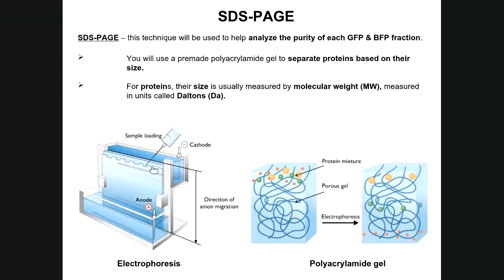Okay, the gel would actually be here, but the polyacrylamide gel is actually a very thin, flat gel. It has a square or rectangular shape to it, and it's sandwiched in between two plastic plates. Okay, and on one side of the gel, normally you would have a comb with little teeth that you would pull out, and that comb would leave little indentations in the gel, such as where you see this needle pointing. We call these wells, and that's where you would add your protein sample.